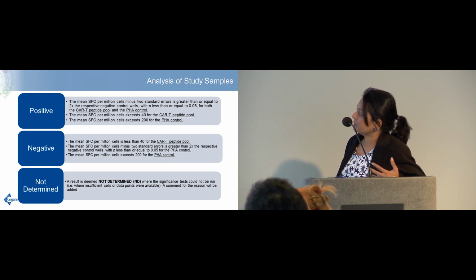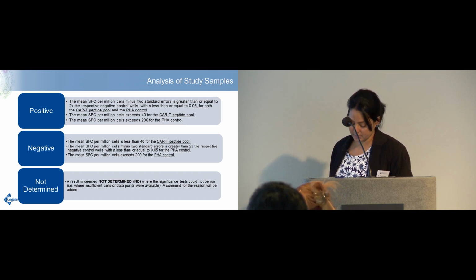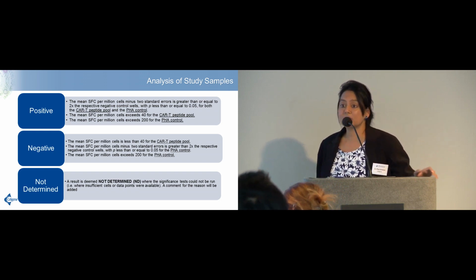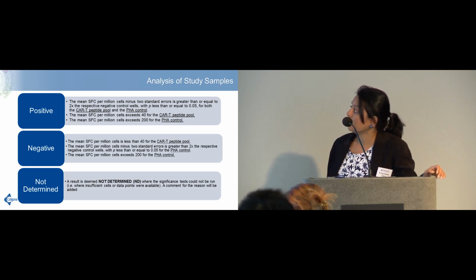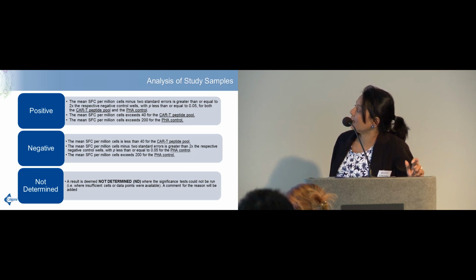If any of these conditions are not met, it would be a negative. And if we don't have statistical significance, or if we just don't have enough PBMCs, we will just call it not determined. So this sample analysis is ongoing. We've already analyzed some clinical trial patient samples with this assay. Everything's functioning well and as expected. So far, so good, keeping fingers crossed there.